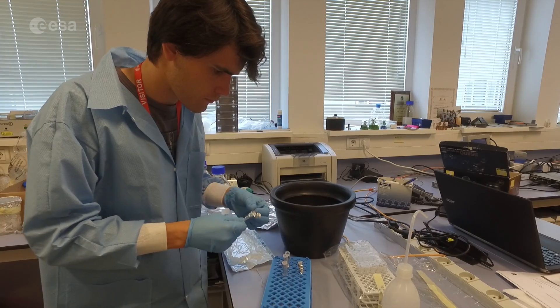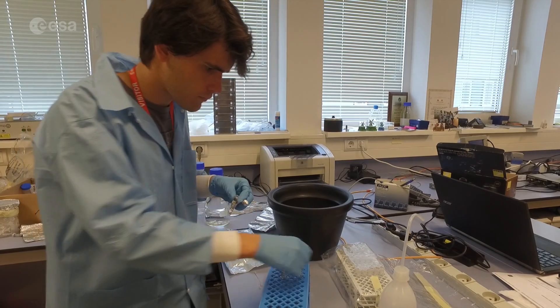Our team's idea is to try and use hypergravity to stimulate tendon regeneration. What we are doing is using the large diameter centrifuge here at ESTEC and culturing our tendon cells inside it. We are going to check what happens when the cells are exposed to hypergravity and if we can actually help tendon regeneration.